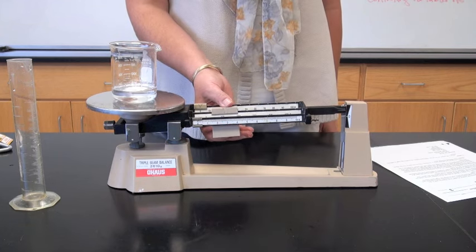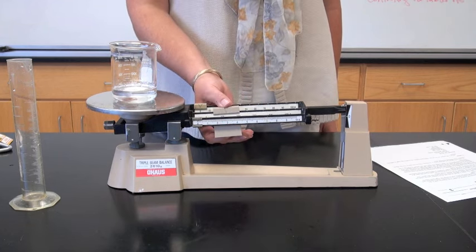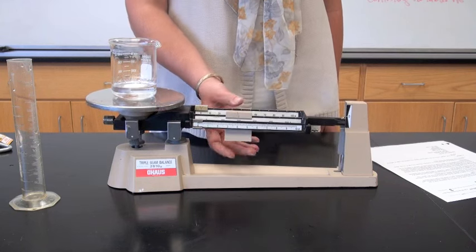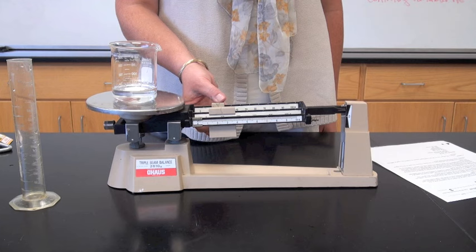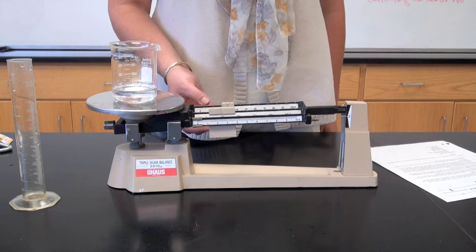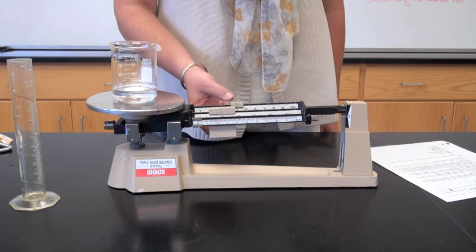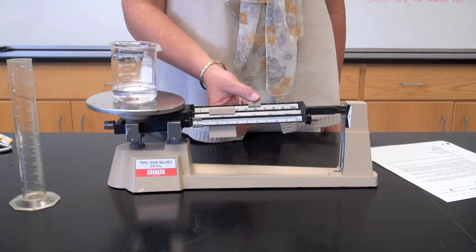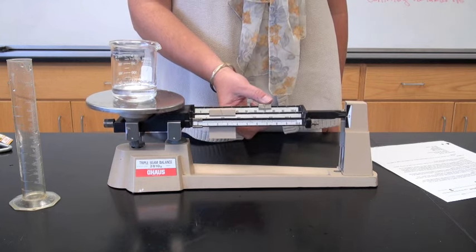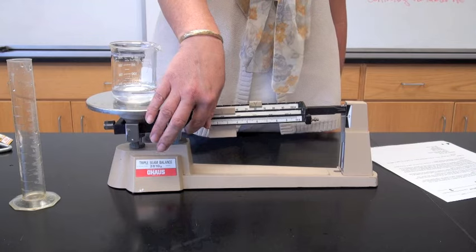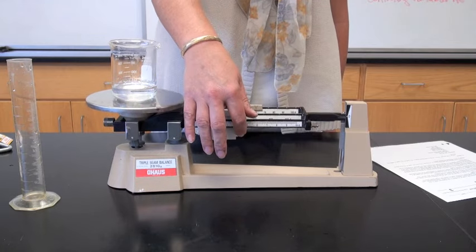Move the 100 gram rider first, and again, it drops, so I move it back one notch. Now I use the ten grams. Ten, twenty, thirty, forty, fifty, sixty, seventy, it drops. I move it back to sixty. Now I use the little one, until it zeroes out.